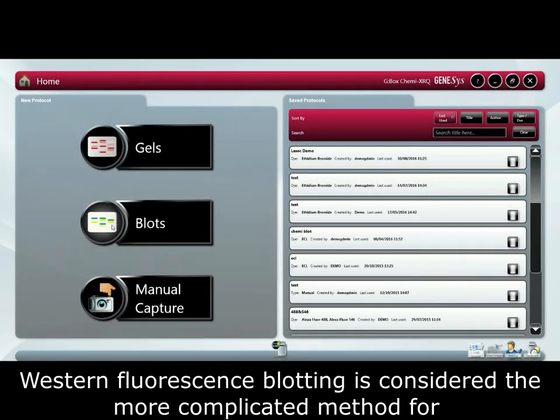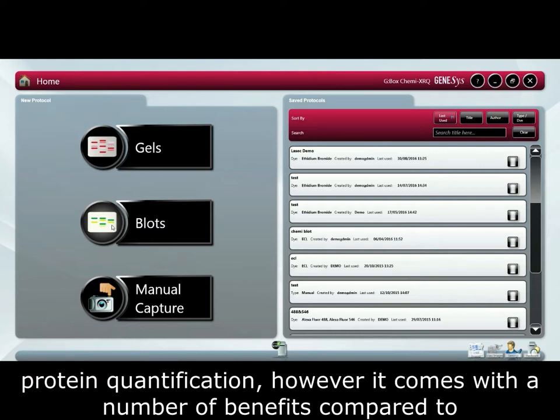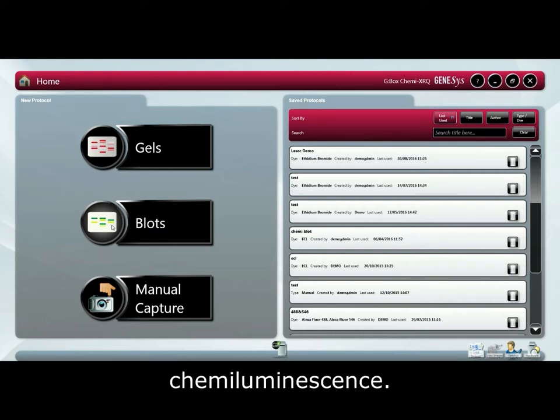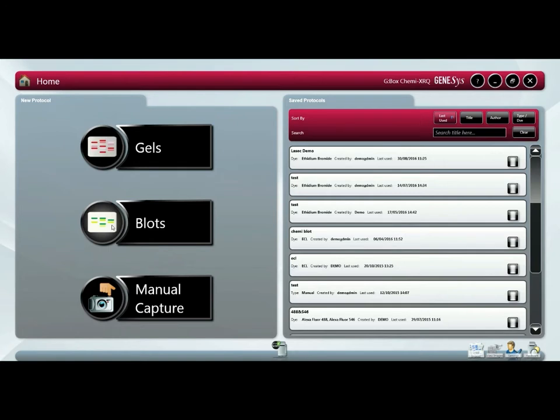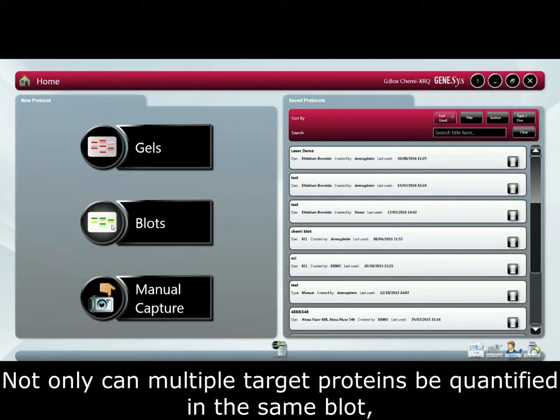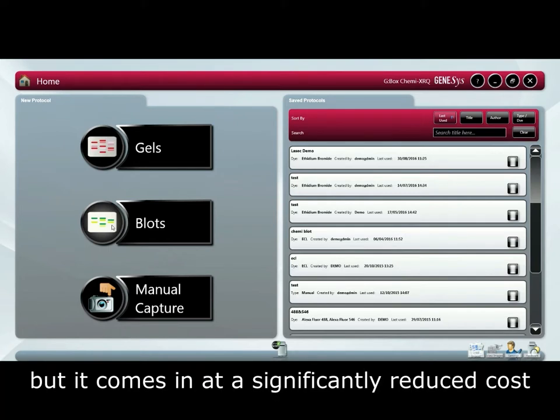Western fluorescence blotting is considered a more complicated method for protein quantification. However, it comes with a number of benefits compared to chemiluminescence. Not only can multiple target proteins be quantified in the same blot, but it comes at a significantly reduced cost.